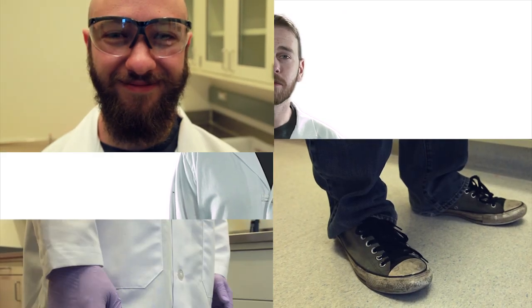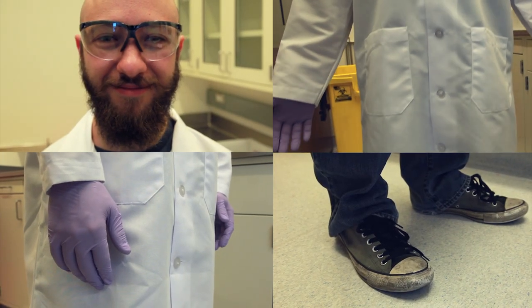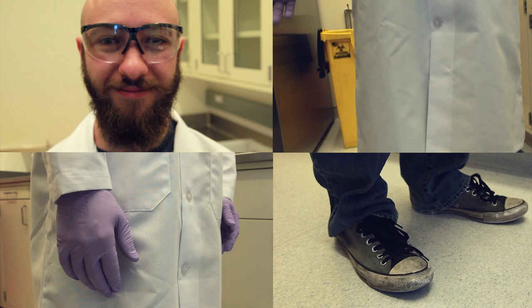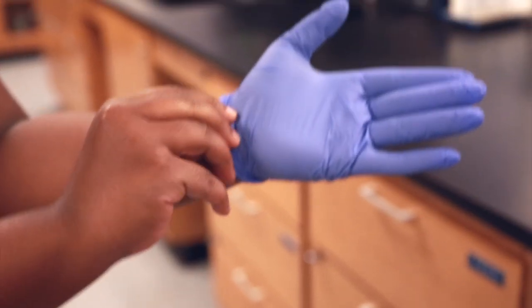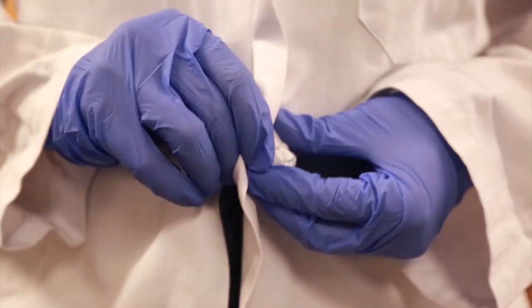Before starting any kind of work in a laboratory, make sure you have the correct clothing, like closed-toed shoes, pants, and shirt. Also, tie long hair back and make sure to find correctly fitting personal protective equipment, or PPE. This includes gloves, a lab coat that isn't too small or big, and eye protection. Remember, PPE is required at all times when working in the laboratory or with lab equipment.